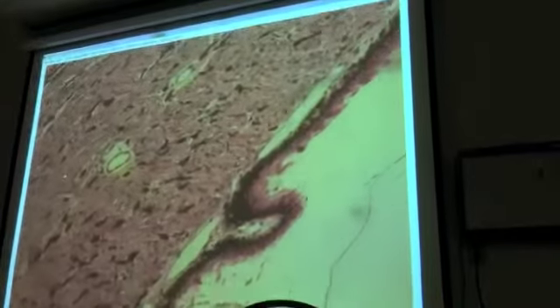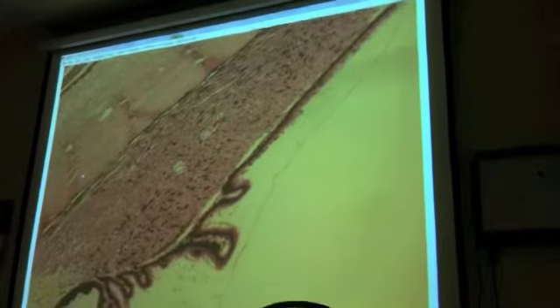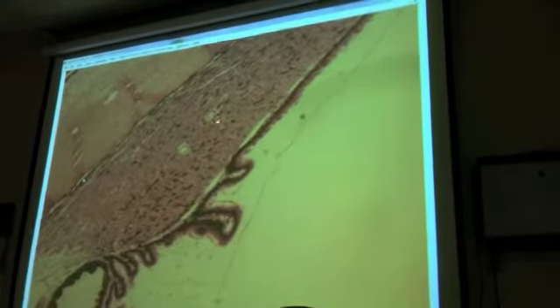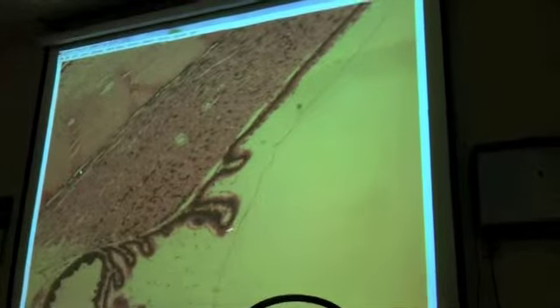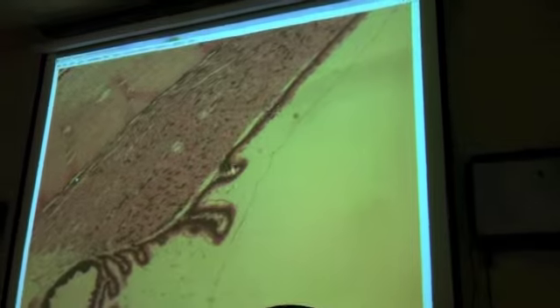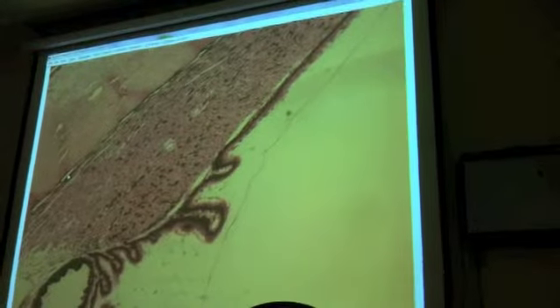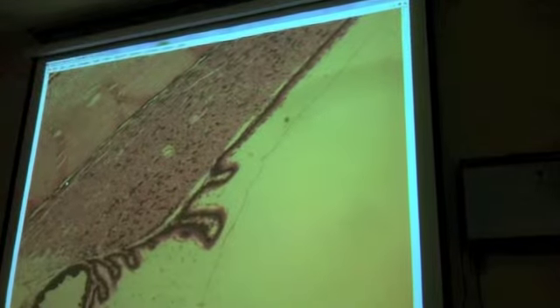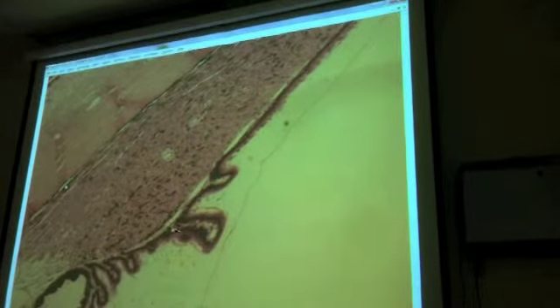the ciliary body, and I should probably be at a lower power. I'm sorry. Makes it look not quite so huge. So the smooth muscle coming into the choroid layer with these processes, that's all part of the ciliary body. And it is a development of the choroid layer. It's got smooth muscle, it's called ciliary muscle. These are called ciliary processes.